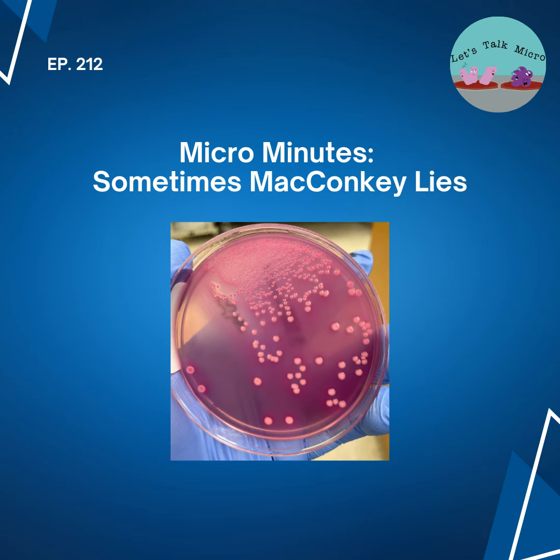And what you see with this, however, just to be clear, because when it comes to gram-negative rods, your Enterobacterales, your non-fermenters like Acinetobacter, Pseudomonas, Stenotrophomonas, those grow quite large on MacConkey. So when you have yeast growing on MacConkey, you see these pinpoint colonies. So be careful. You see this pinpoint growth, do not assume that it is a gram-negative rod.